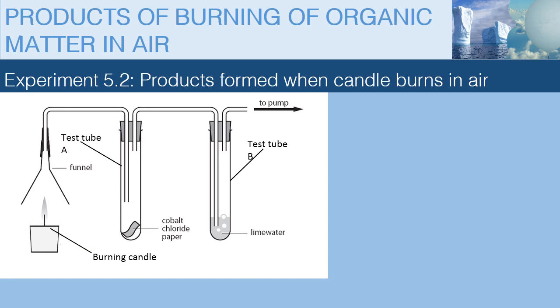The candle burns in air. The solid wax in the burning candle, some of it, instead of just undergoing a physical change from solid to liquid and then back to solid on cooling, it reacts with air. And air contains oxygen, which is the active part. And the products are sucked from the funnel to the first test tube A.